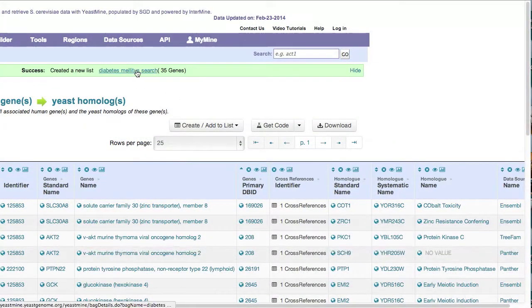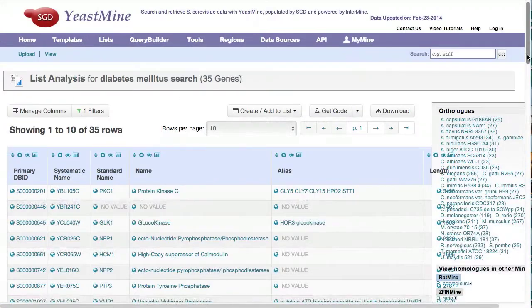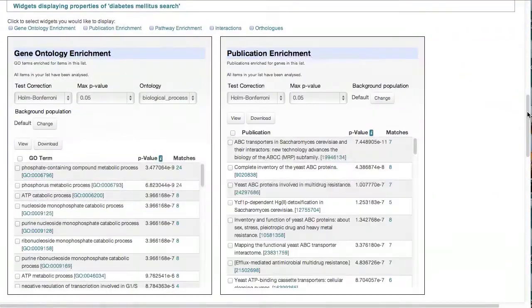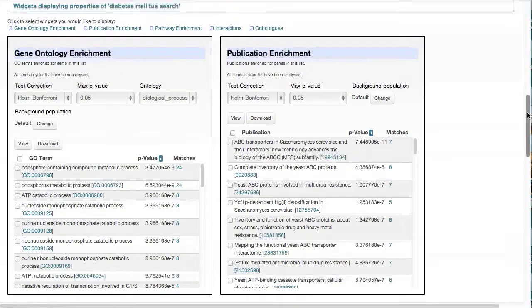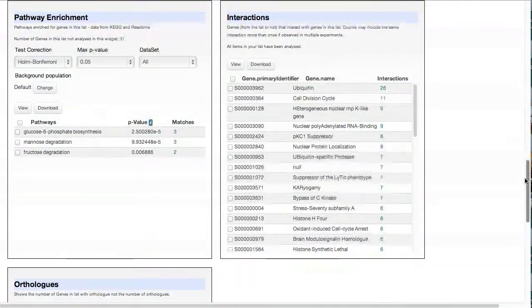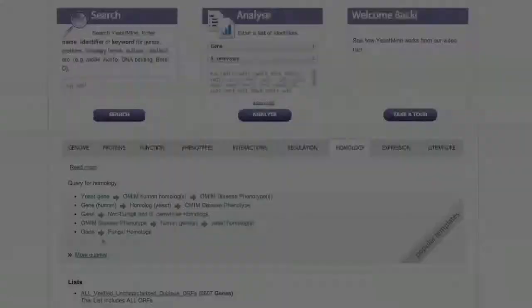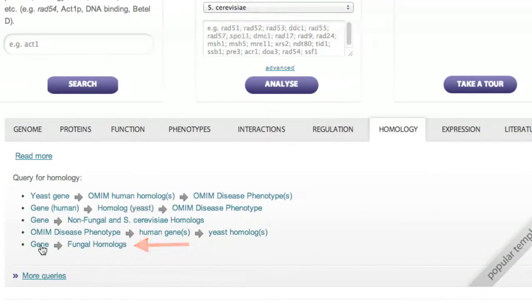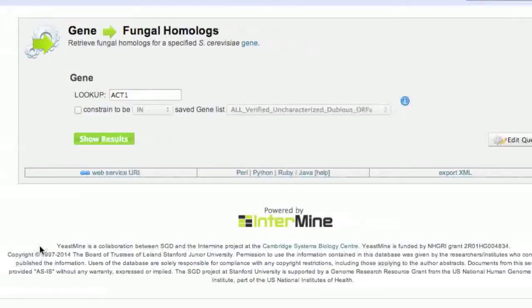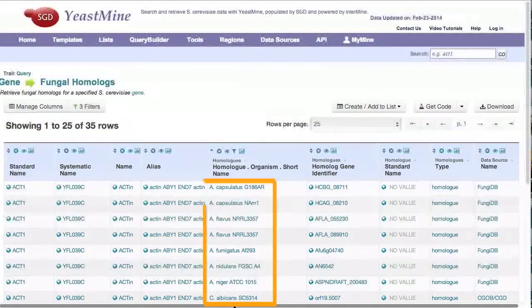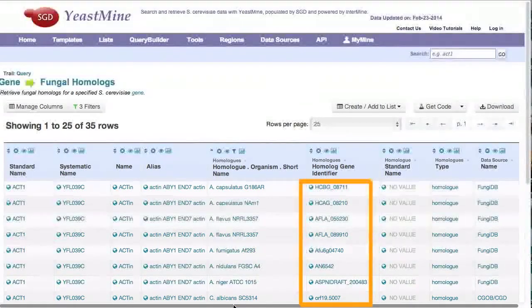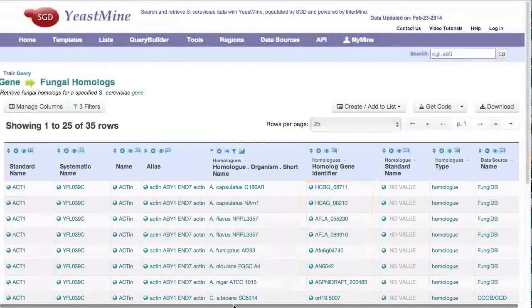You can also quickly look at the GO, Pathway to Publication Enrichment widgets, among others, for this list. Lastly, you can find fungal homologs for a given gene using the Gene to Fungal Homologs template. The data for 24 different fungal species are searched and returned, providing gene identifiers that link to their original source.